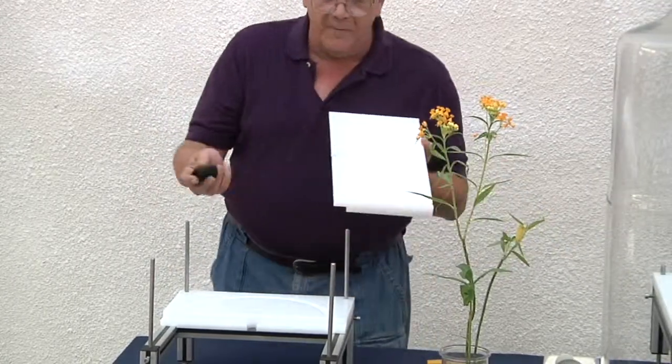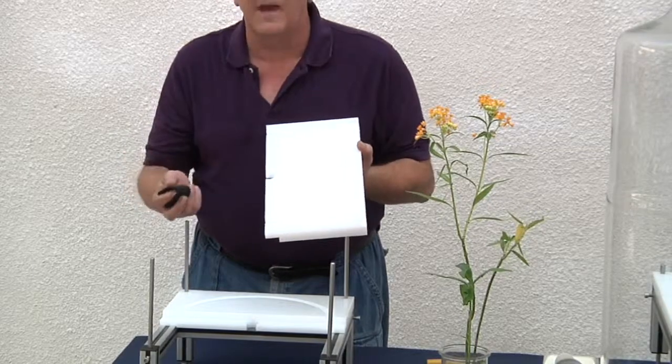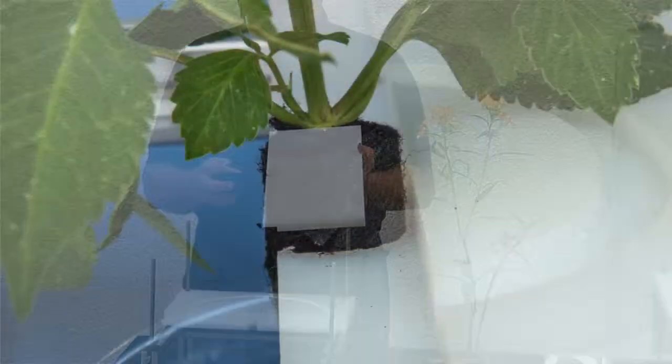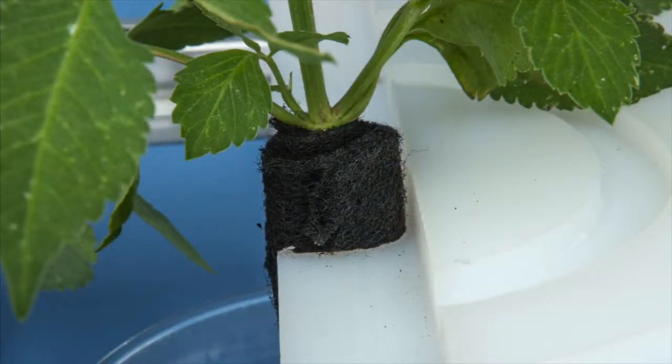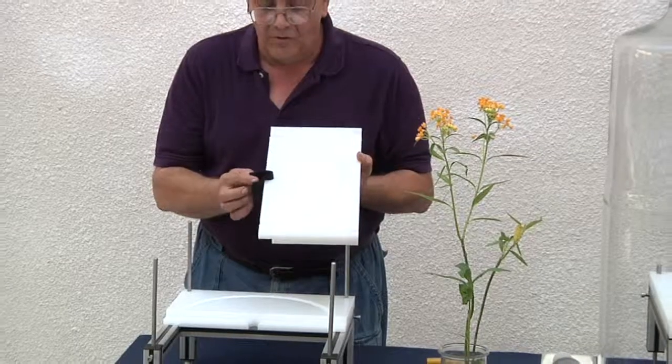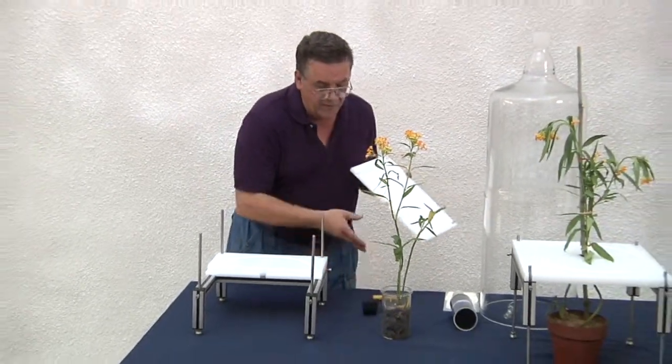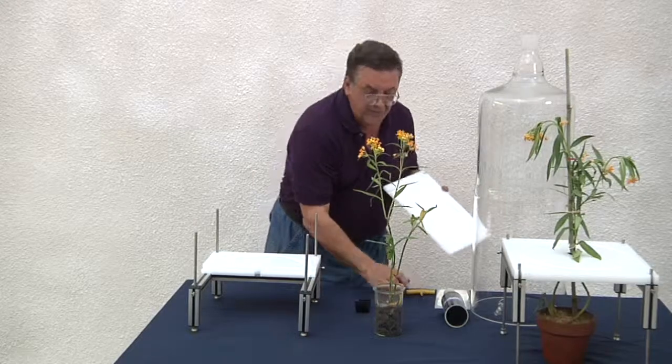To keep air from entering the system that is contaminated by biologicals or semiochemicals, we wrap the stem in activated charcoal. This allows air to flow in but not to affect our tests.